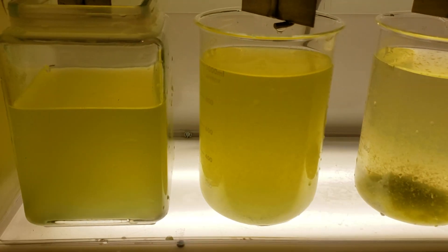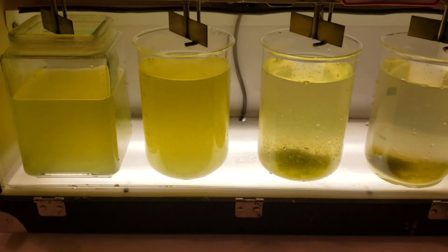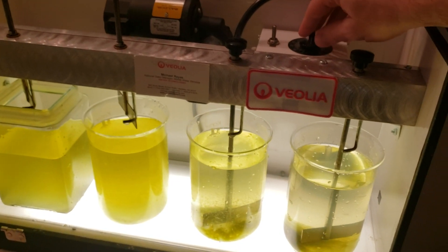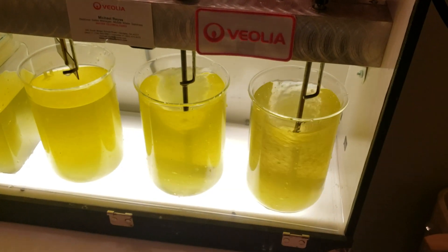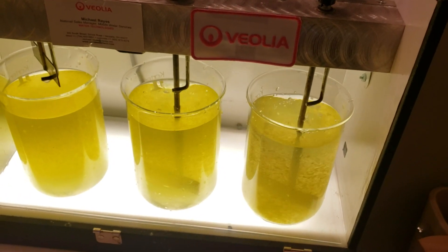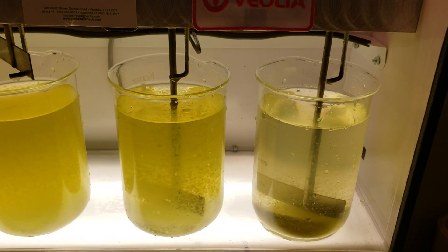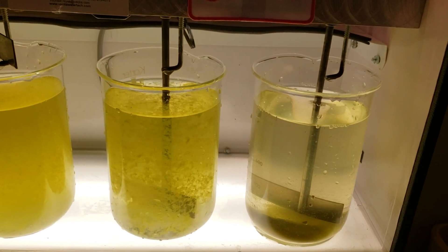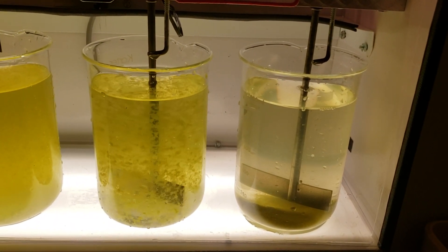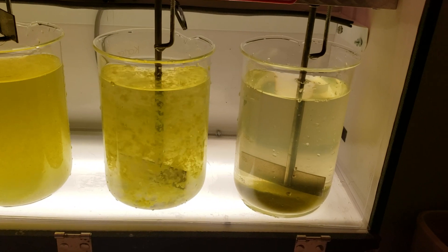Even given several hours, and the one with just coagulant will settle out in about an hour's time and make good water. We'll spin up the active flow jar again to show you how quickly it settles. There you go — there's the difference between conventional settling and ballasted settling with active flow.